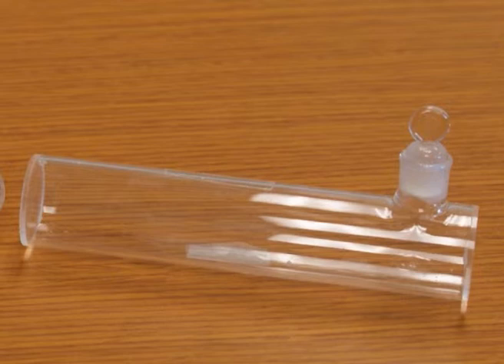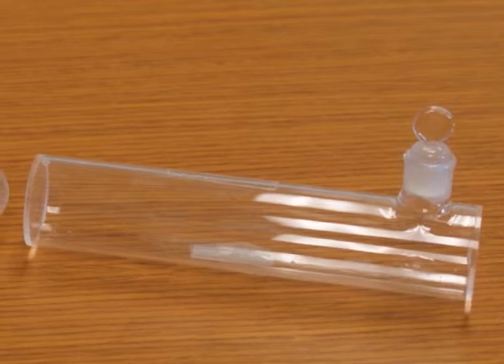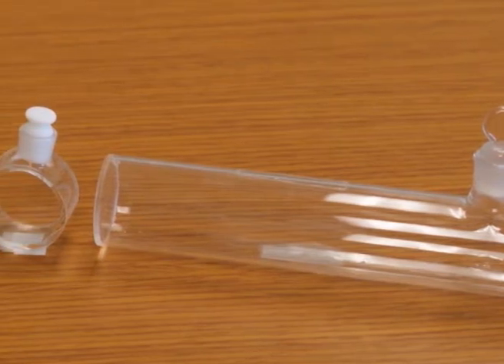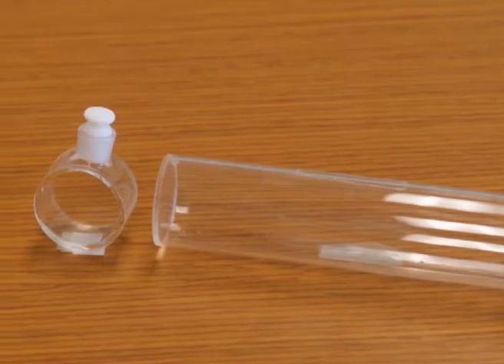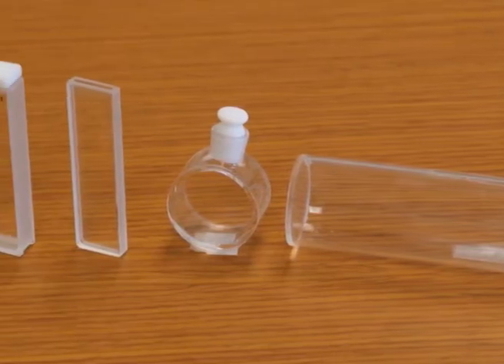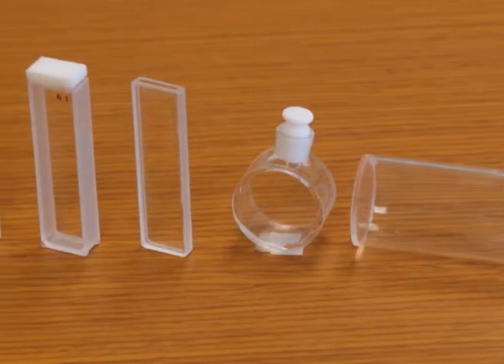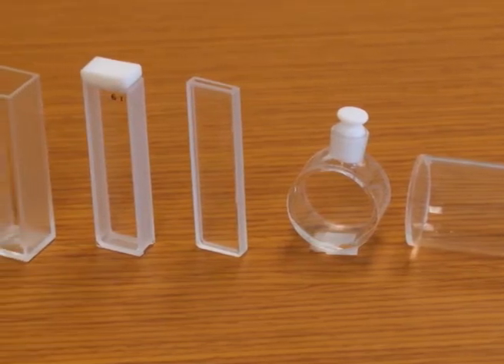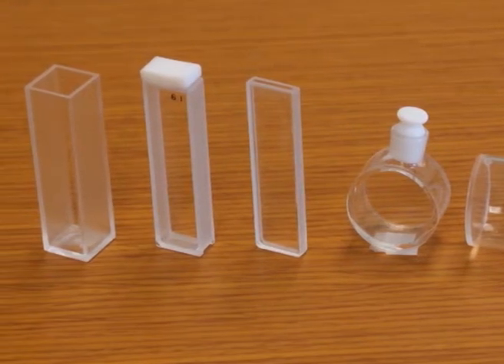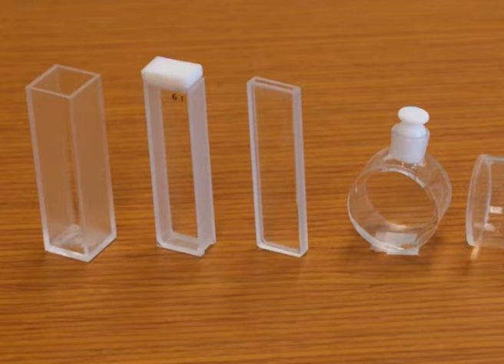The solution of the compound is placed in a container or cell which does not absorb the electromagnetic radiations in the region under study. The sample compartment hence provides a light tight environment which restricts the addition of stray radiations. Quartz cell of 1 cm path length is generally used for this purpose. The cells with other path lengths are also available. Cells with larger path lengths are useful for the analysis of very dilute solutions.